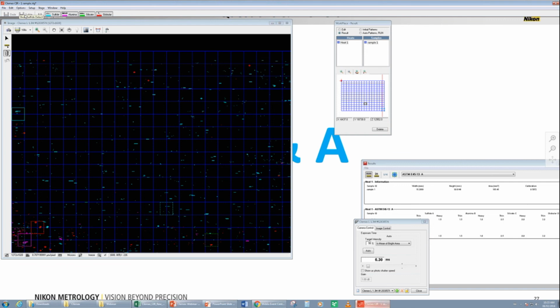So the cleaner the sample, the less work there is. But like everything else, having a good preparation is as important as having a good dimension on a tensile test or a chemical analysis. You would put the right constituent in there. So in this case, you need to have a good sample preparation, and it's pretty easy to adapt to a good procedure.